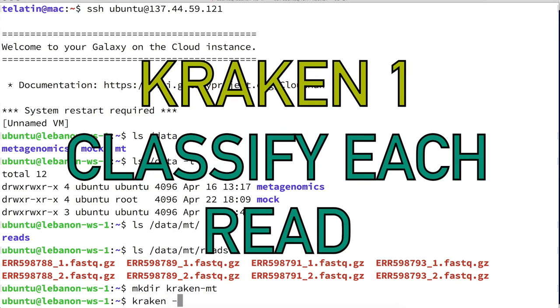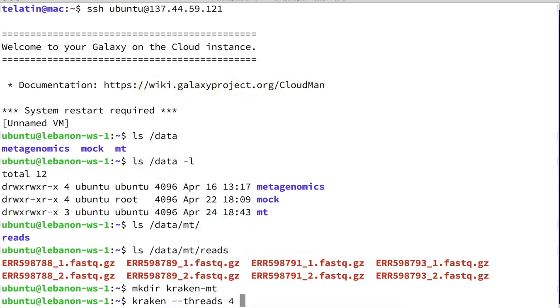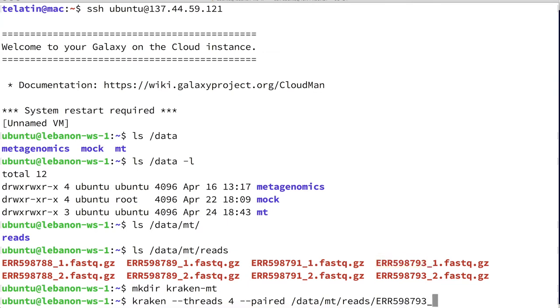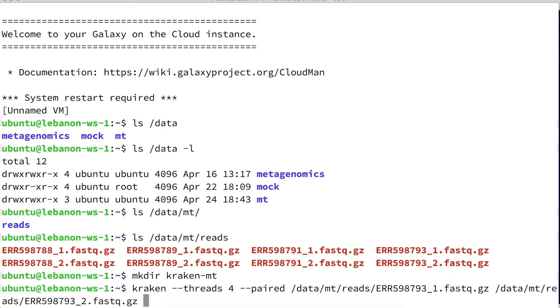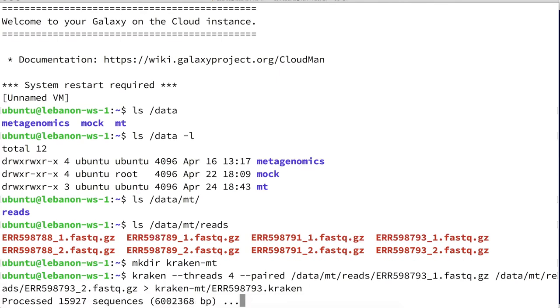Let's start with Kraken. We use --threads 4 to use four processors, and --paired to specify that we are using paired-end reads. Then we provide the data path MT/reads, specifying first the R1 file and then the R2 file. We redirect the output to the kraken.mt directory using the accession name with a .kraken extension, just to remember what we did.